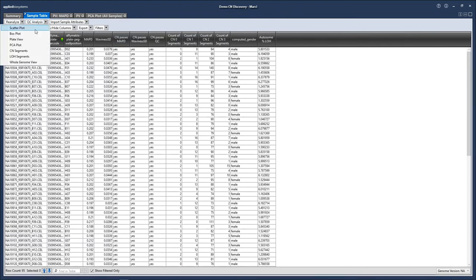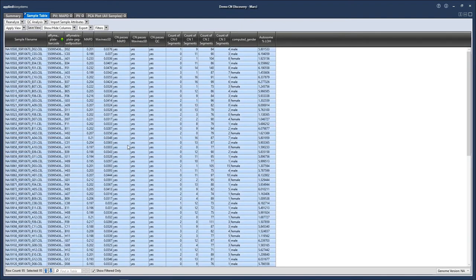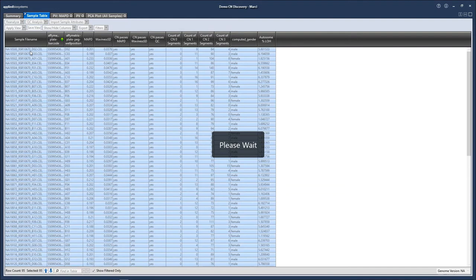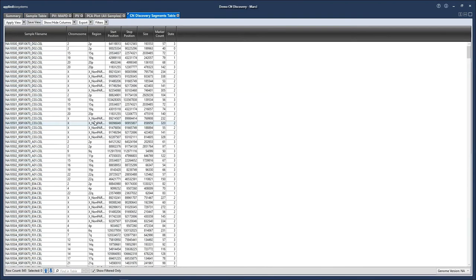Now we can generate a CN segments table. We can choose to include all of the samples in our segments table or just select one or a few samples. This table will display any segment that has been assigned a copy number state of 0, 1, or 3, as well as copy number state 2 for non-pseudo autosomal regions on chromosome X in males. So this is a table of our copy number gains and losses.